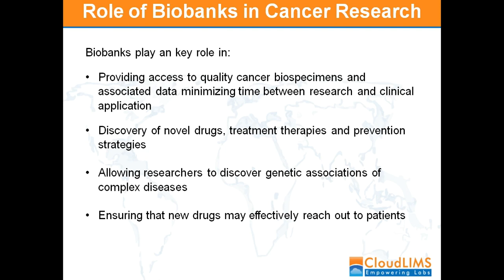Role of biobank in cancer research. Biobanks play a key role in providing access to quality cancer biospecimens and associated data, minimizing time between research and clinical application, and discovery of novel drugs, treatment therapies, and prevention strategies. Biobanks also allow researchers to discover genetic associations of complex diseases, ensuring that new drugs may effectively reach patients.